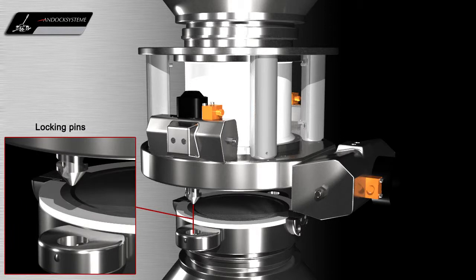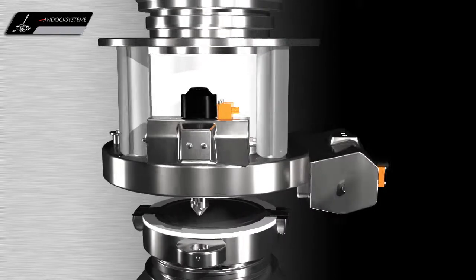The GMP design locking pins are used to align the active and passive valves before locking the two halves of the valve together.